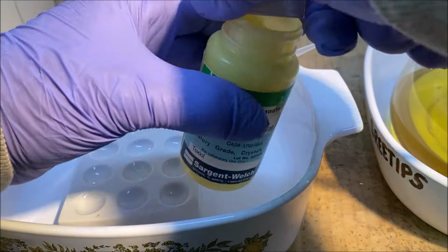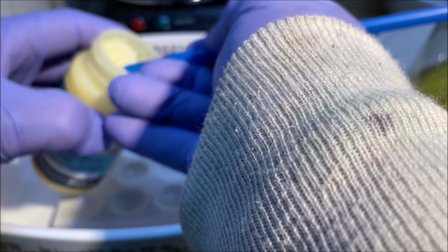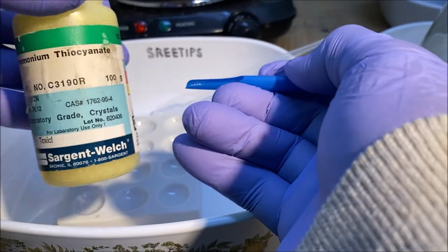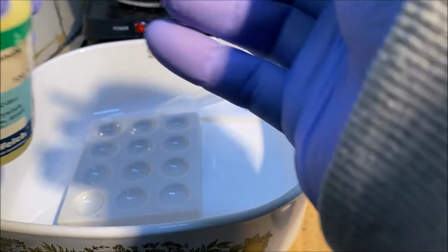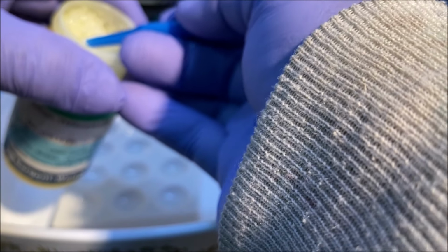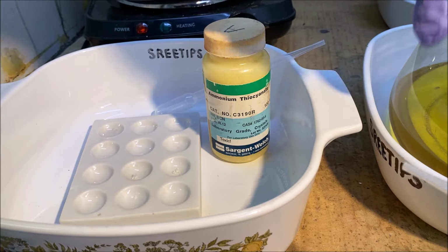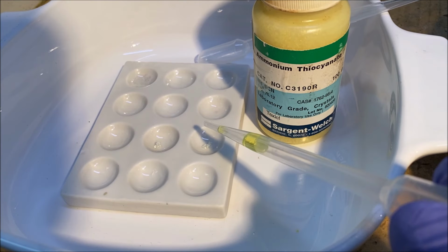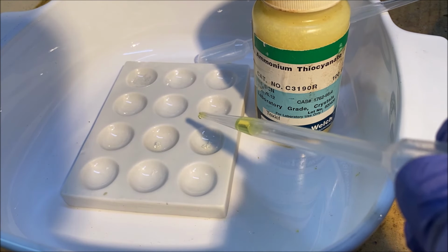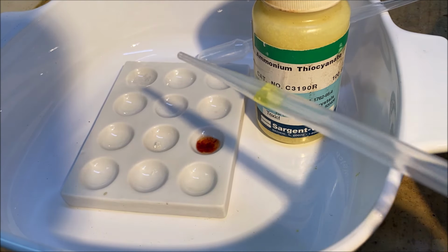This is a simple test to check for the presence of iron in our liquids. This is ammonium thiocyanate. Put a little bit of it in our spot plate cavity here. Some of the liquid out of this container. I know it has iron in it, and just watch what it does when it hits that ammonium thiocyanate. It'll turn blood red, and that's how I can tell that there's iron in this solution.